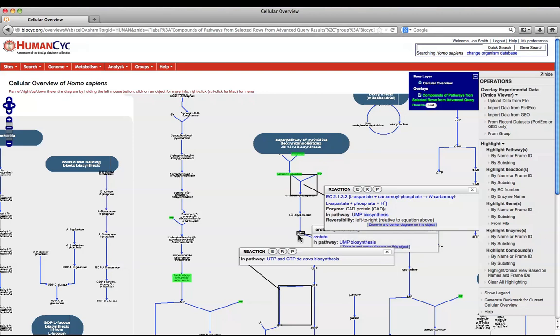The ERP buttons within Reaction Tooltips let us control how much information is presented. The control panel at the right lets us remove or add back highlighting for multiple sets of genes that we might have highlighted at one time. Quantitative concentrations values for multiple time points can also be painted onto this diagram.